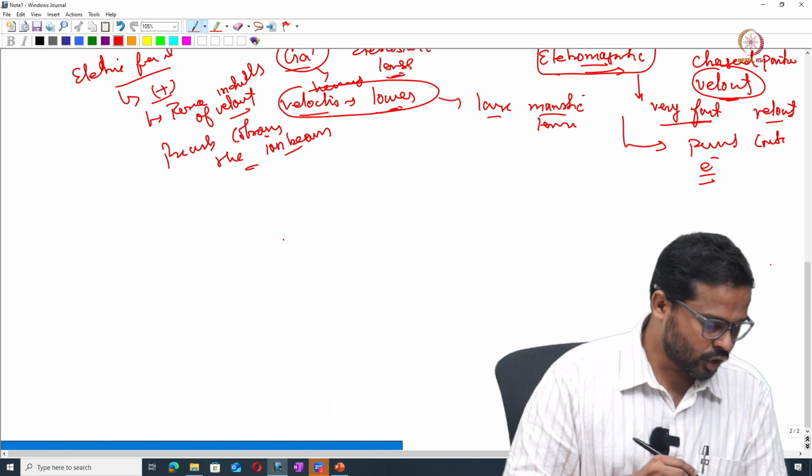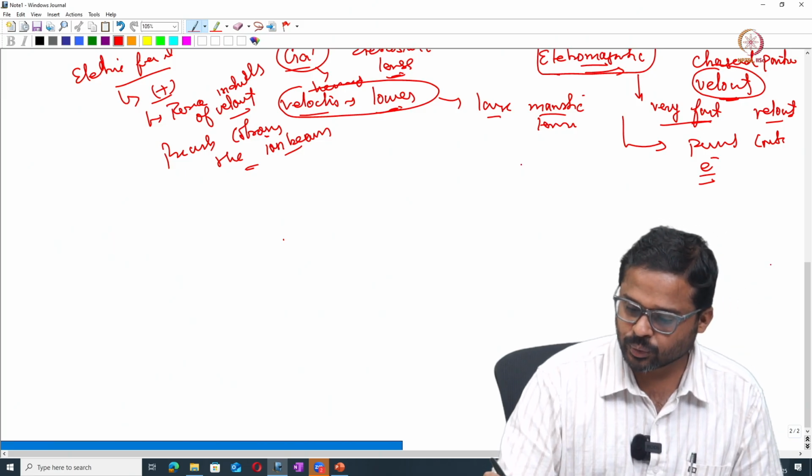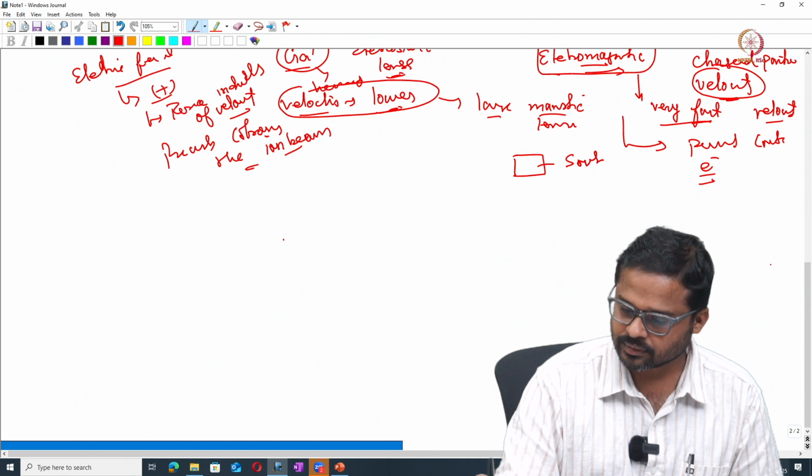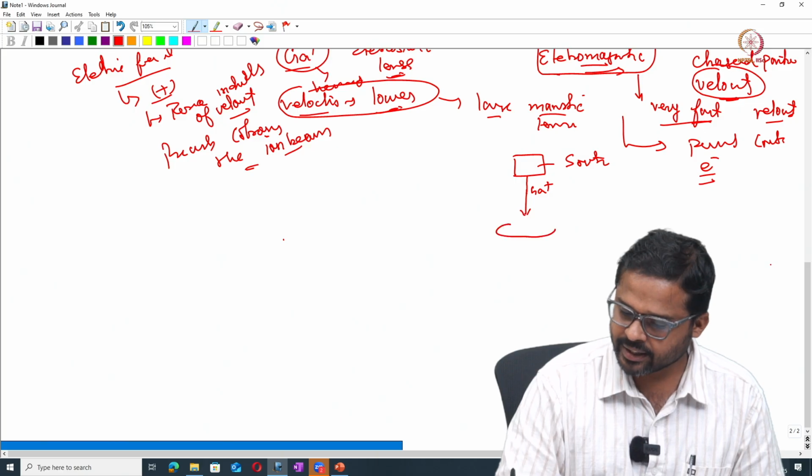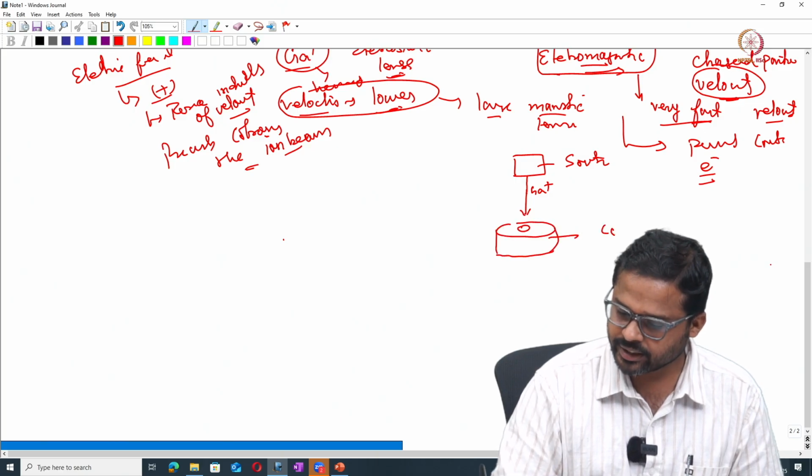Now we also talked about the apertures. So you have a source, okay, your gallium plus ions accelerate towards the column, then there will be a condenser aperture, correct? This is your condenser aperture or condenser lens.